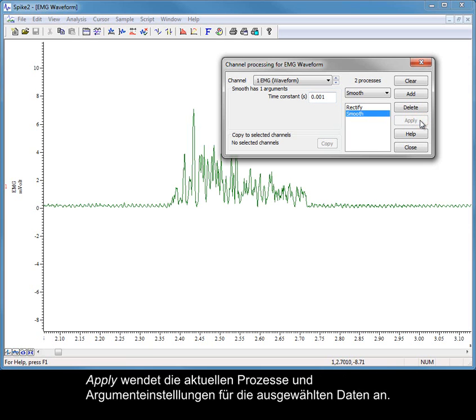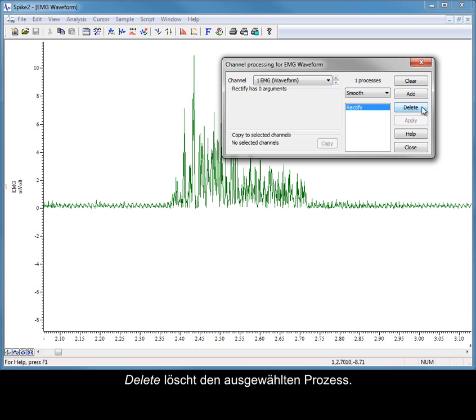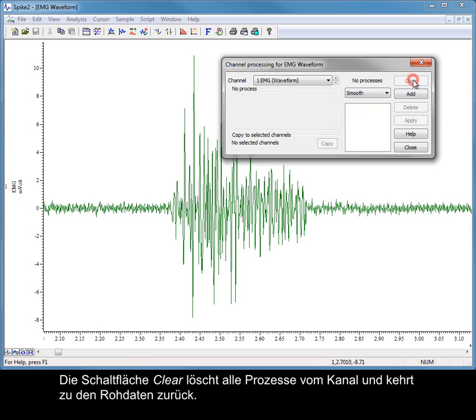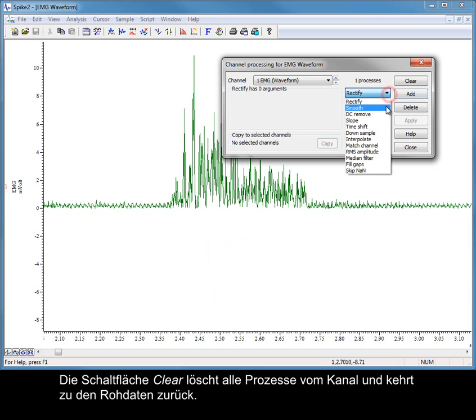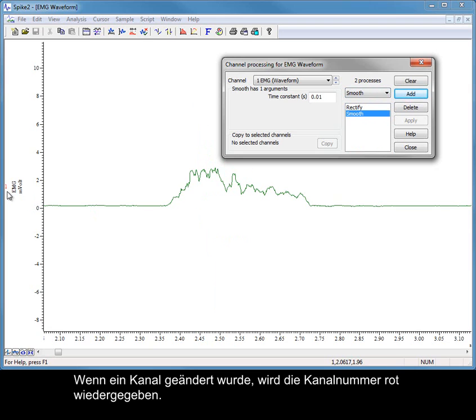Apply applies the current processes and updated argument settings to the selected data. Delete removes the selected process. The Clear button removes all processes from the channel, reverting back to the raw data. If a channel has been modified in any way, the channel number is displayed in red.